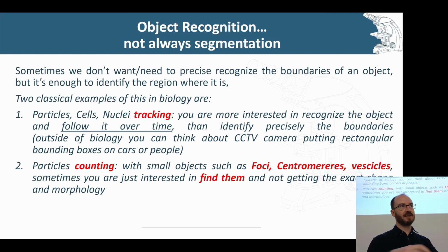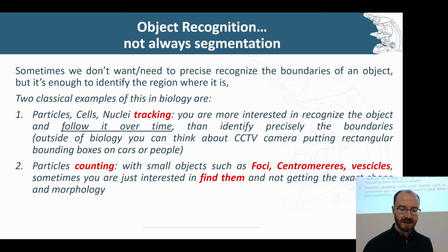So often you have particles that you want to track. Sometimes these particles can be really, really small and you want to see how they move throughout the cell. Other times they're nuclei that you want to maybe track in the scene. One way that you can do this tracking is using something like TrackMate. It's not listed on the slide, but in Fiji there's this plugin called TrackMate which allows you to set up some conditions and then it tracks things across time.